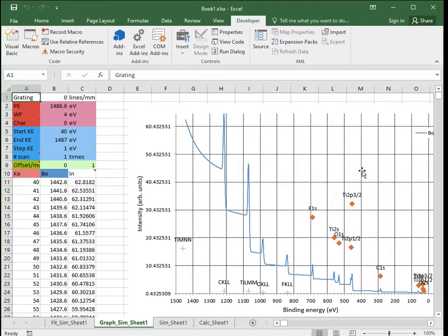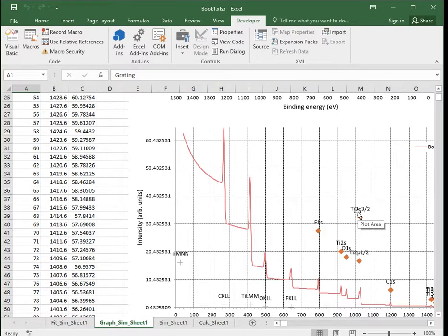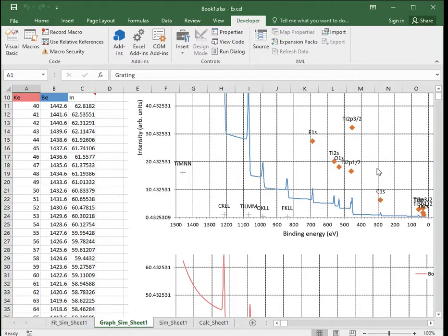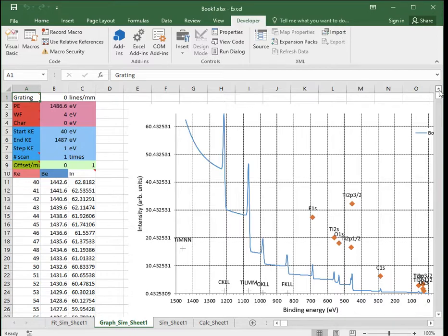You can clearly separate all the photoemission peaks at binding energies similar to the other spectra we simulated previously, but the Auger peaks shift to higher binding energy, which means lower kinetic energy. The Auger peak is at constant kinetic energy and the photoemission peak is at constant binding energy, so both of them are clearly separated. That is the great advantage of the aluminum K alpha source, for most of the photoemission peaks can be clearly separated across the periodic table.